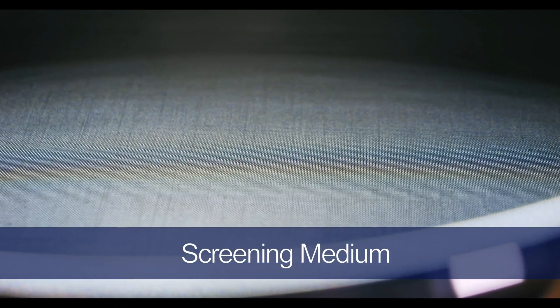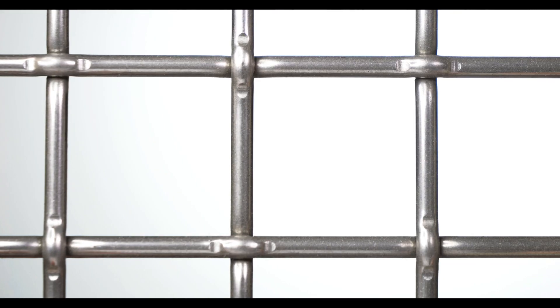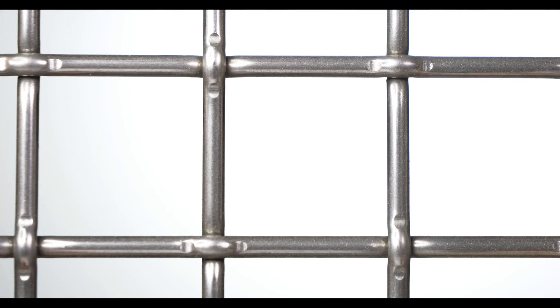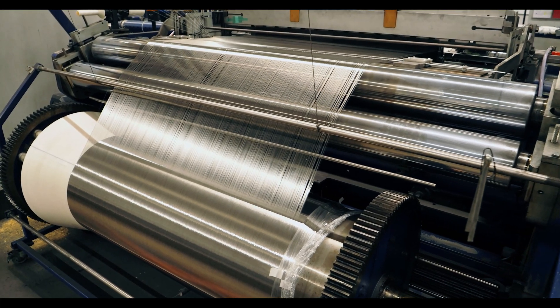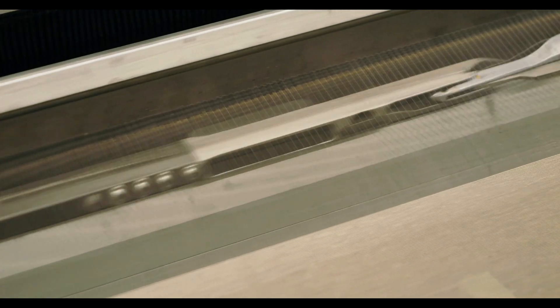The screening medium, like woven wire mesh, is the most critical part of any testive. It's used to separate the larger particles from the smaller ones, giving you an accurate reading of the material being worked with. Generally, stainless steel wires are used to construct the mesh, with a mesh opening size range of 4 inches all the way down to a 635 mesh. It should be noted that testive cloth is woven slightly differently than other woven wire mesh. When weaving testive mesh, the loom is monitored far more strictly to ensure that the mesh openings are precise and fall within the tolerances set by ASTM or ISO standards.